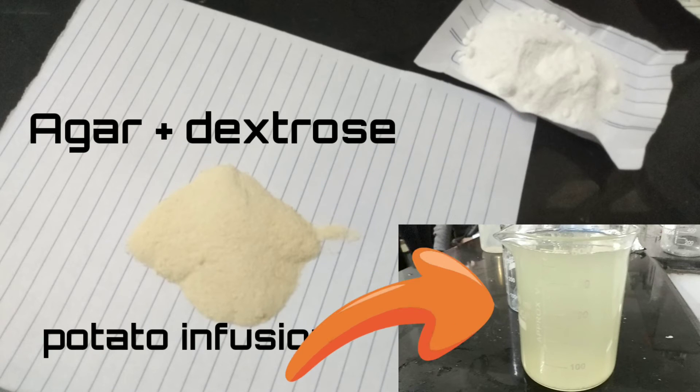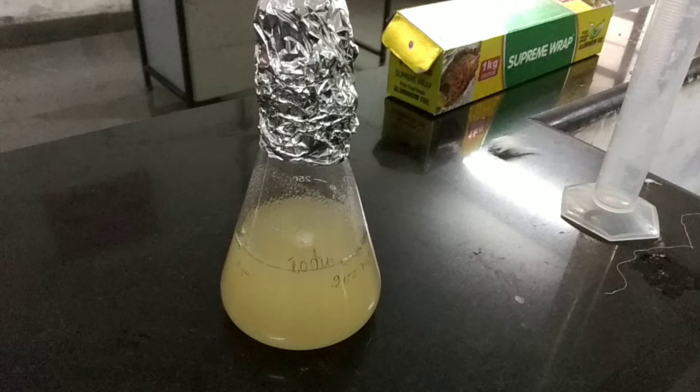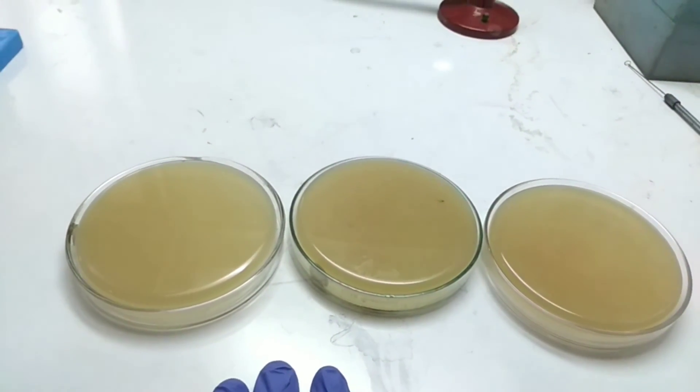Mixing the three ingredients makes the potato dextrose agar. Place the mixture in a conical flask and autoclave it. After autoclaving, add 10 percent tartaric acid to the potato dextrose agar to make it ready for use. After adding tartaric acid, you can plate it into petri plates and use it for the growth of fungi.